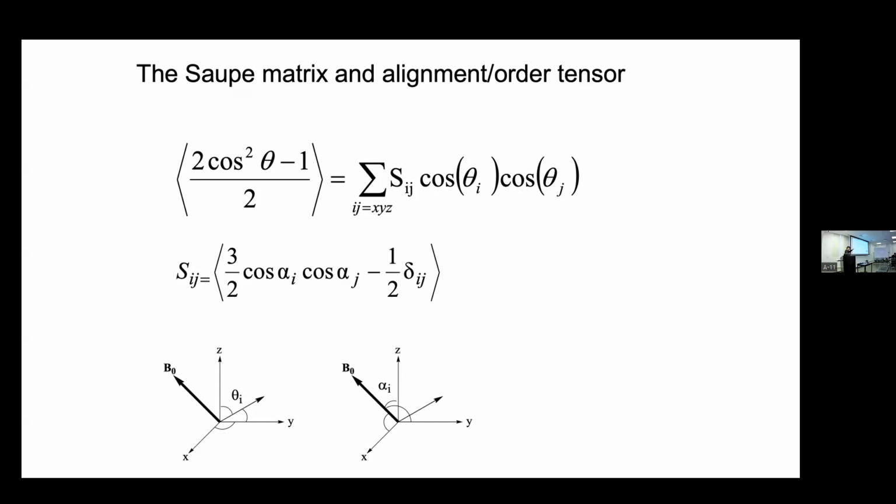And you can do that by using the steric model that I mentioned Bax developed with Zweckstetter for nucleic acids. The steric model works great. It's called PALES. But not for proteins, well, for neutral proteins. If they're not charged, you could probably use the same idea. For the steric model, you assume that everything is elastic. Yes, we assume that beyond sterics, there are no other interactions.